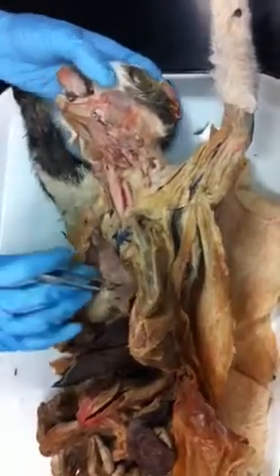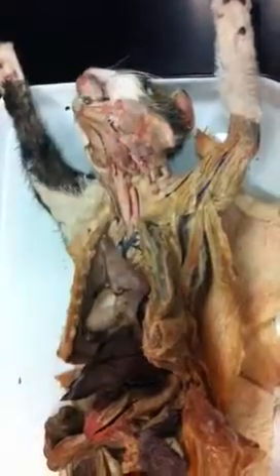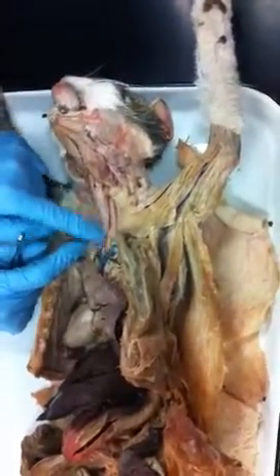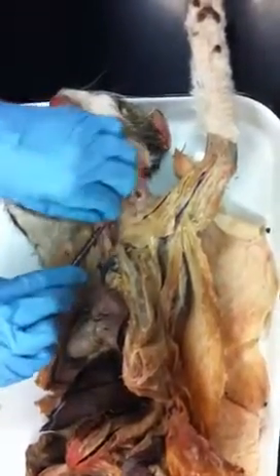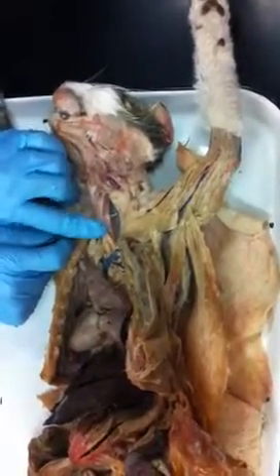Okay, and coming down here, this is clearly the trachea. The trachea is in the front. This right here, this very flexible big tube back here, is the esophagus.